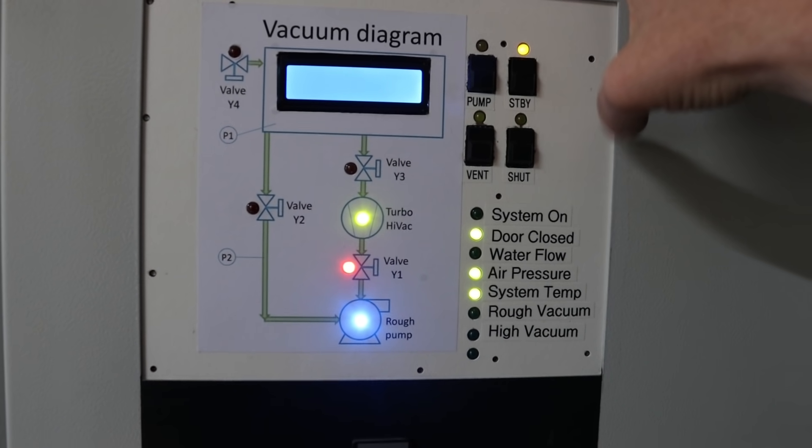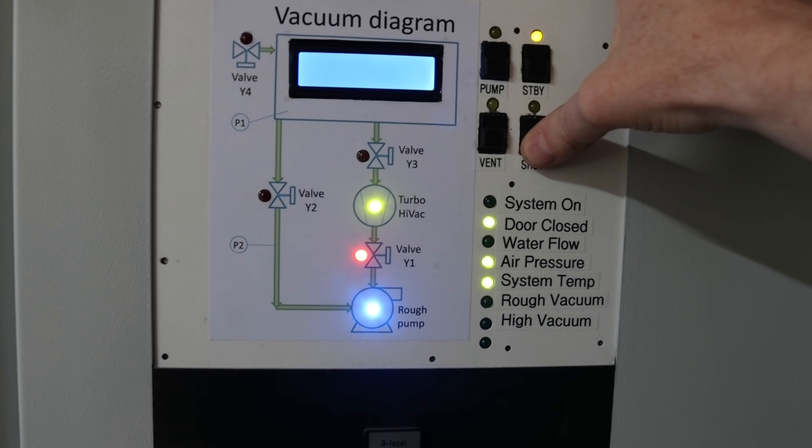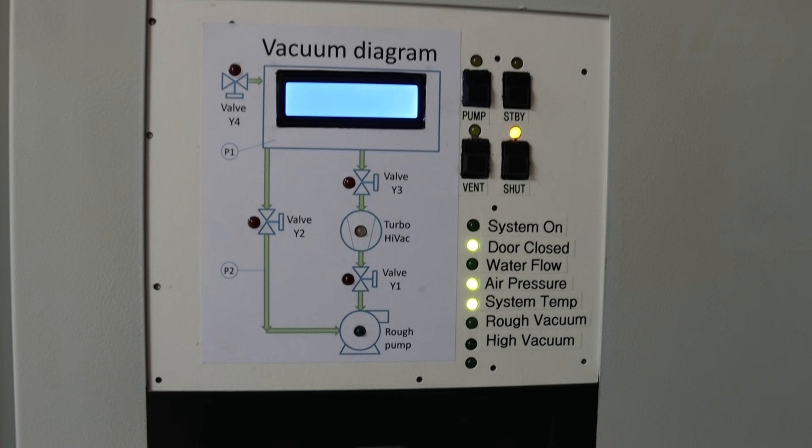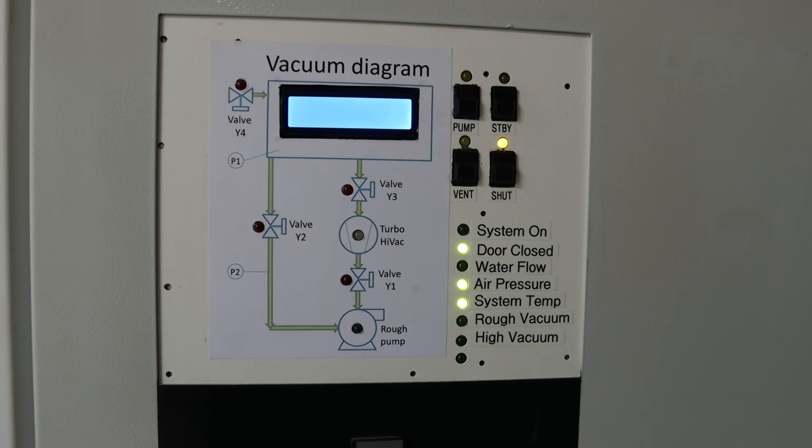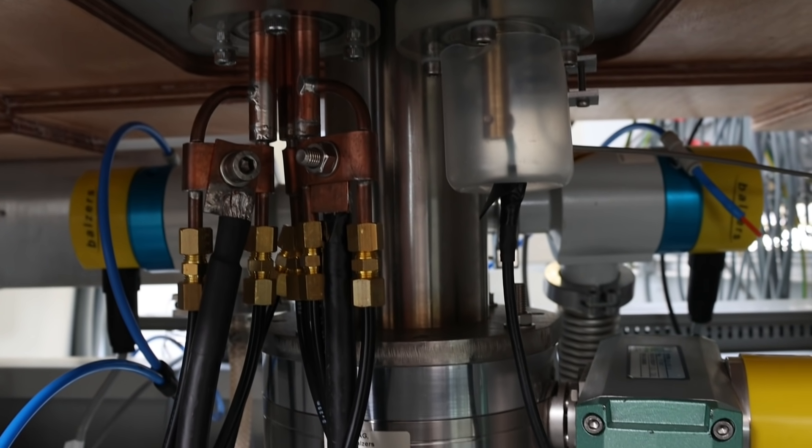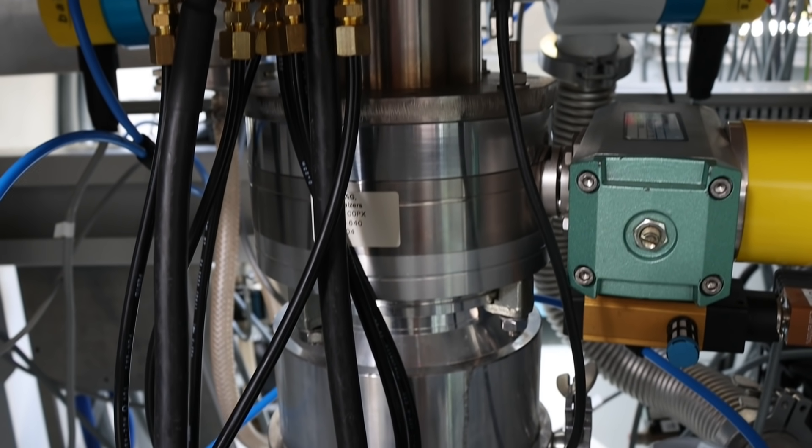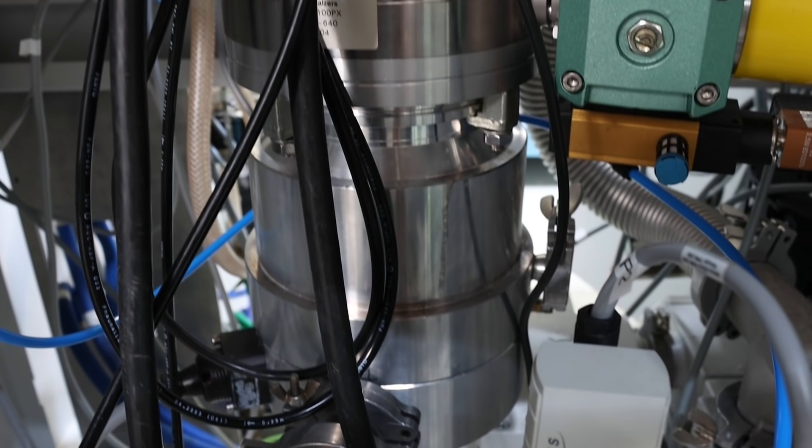Anyway, I will stop here, because this machine is basically just a tool to make optical devices, and it is not a goal by itself. As I said in the intro, it is not possible to go into every single detail here. But if you have any additional questions about PVD technology, or this machine in particular, please ask them in the comments.